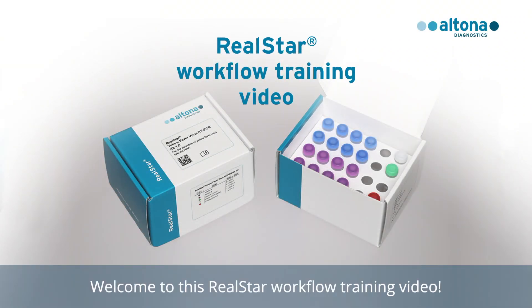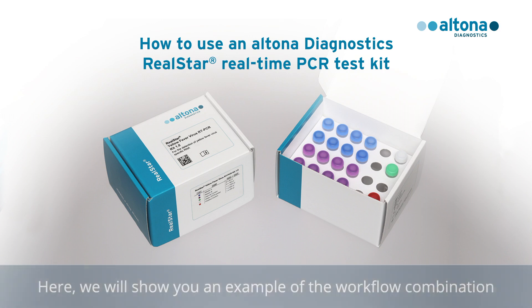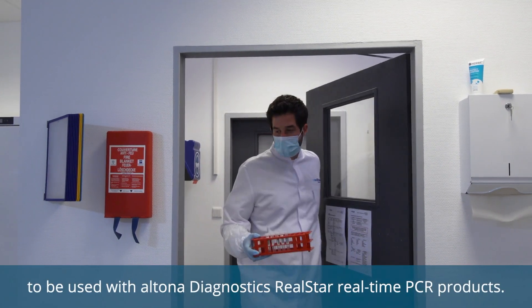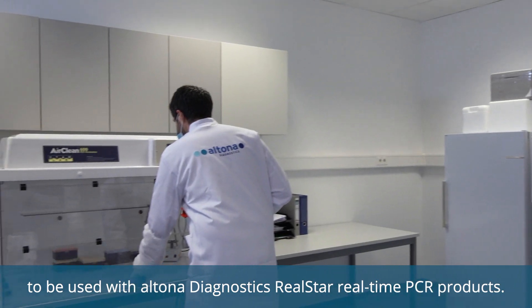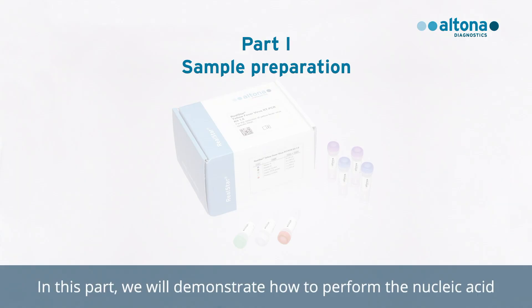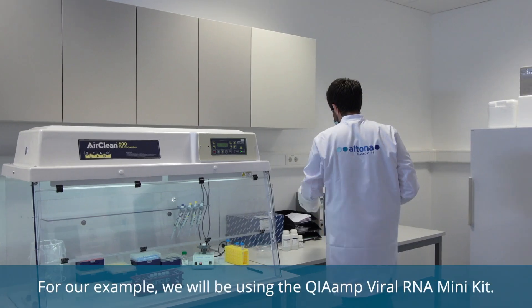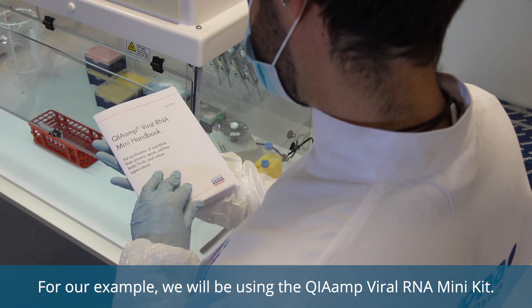Welcome to this RealSTAR workflow training video. Here we will show you an example of the workflow combination to be used with Altona Diagnostics RealSTAR real-time PCR products. In this part, we will demonstrate how to perform the nucleic acid extraction of samples in preparation for the use of a RealSTAR PCR kit. For our example, we will be using the QIAGEN QIAamp Viral RNA Mini Kit.